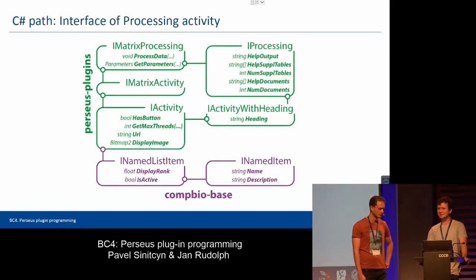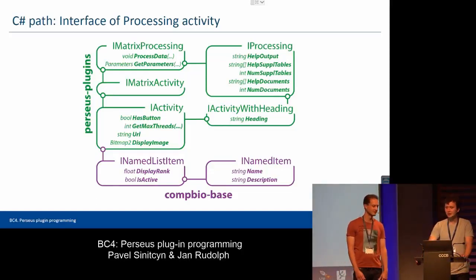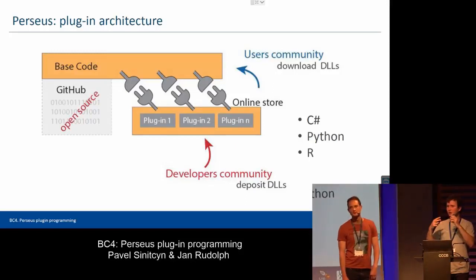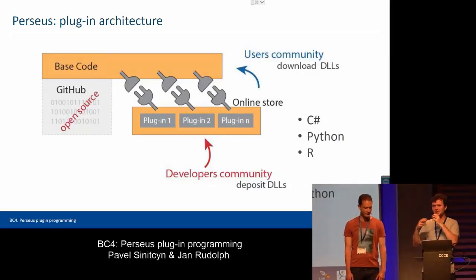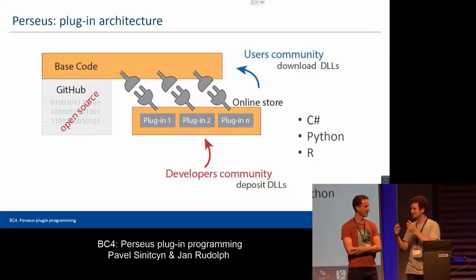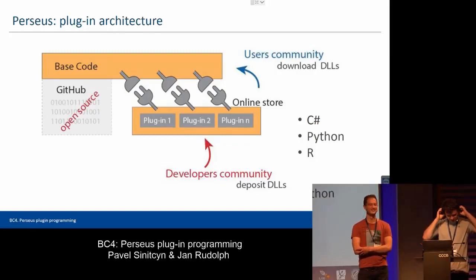Yeah, and actually this slide is, I think, 3 years old. If you're plugging something into something in software development, you should declare what this plugin will look like: what you should expect from the plugin, what you should not expect from the plugin, and basically this declared expectation. Another nerdy way to say this is API. Interface.